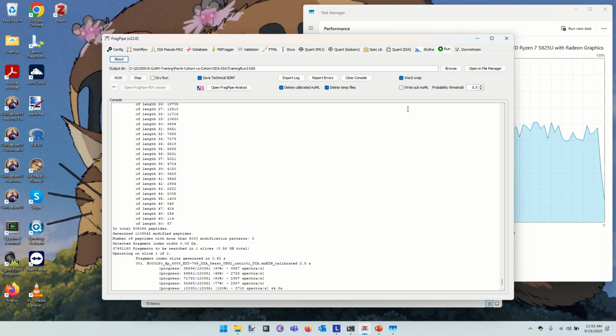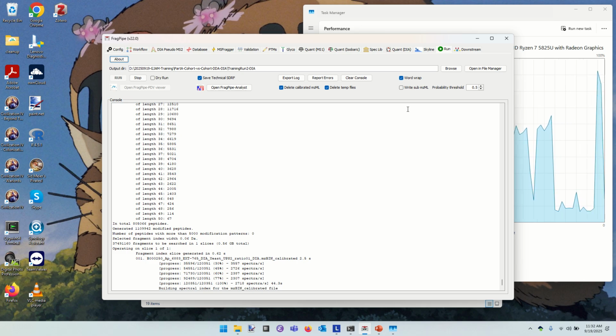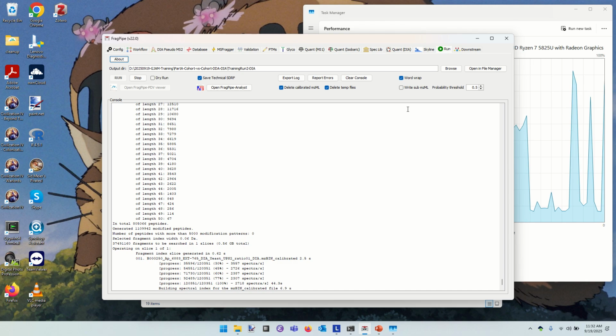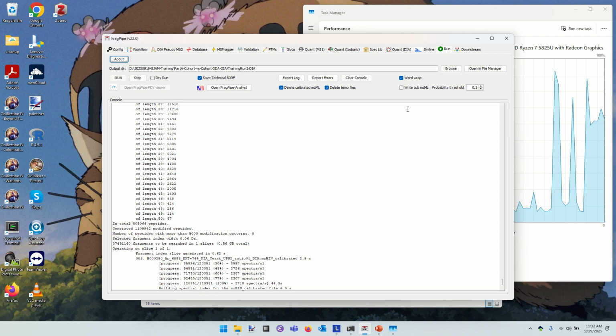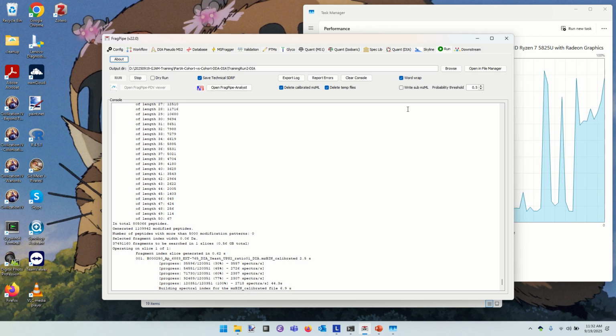So we're having a rather different experience now. We still did our pre-search at the first just to figure out the mass calibration stuff. But look how much longer it's taking on each mzML file separately. We see that the experiment has 120,000 MSMS scans, and even though it's clocking along at better than 2,000 spectra a second, it's taking a fair bit of time to analyze the identifications. So let's spend a moment then on the difference in MSMS spectra for DDA experiments and DIA.